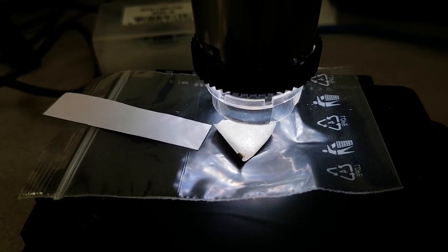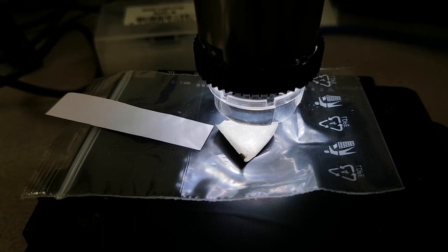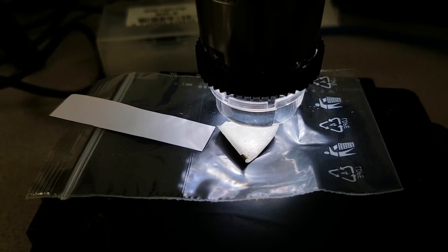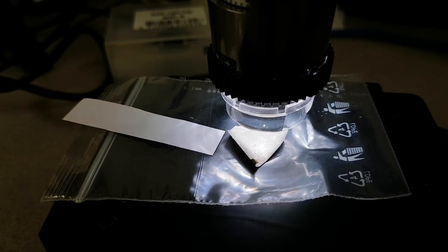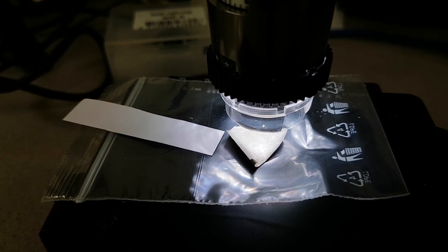Hi, my name is Bob Greener and I'm a volunteer with Martin Fleischmann Memorial Project. Today, I've been preparing samples for the last three days for testing in various locations.